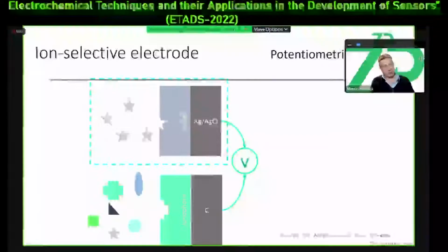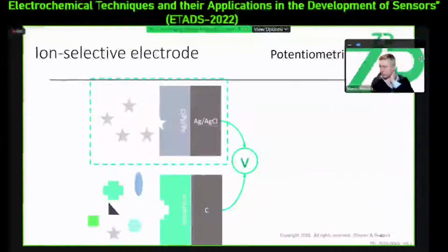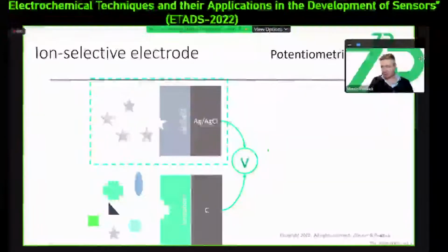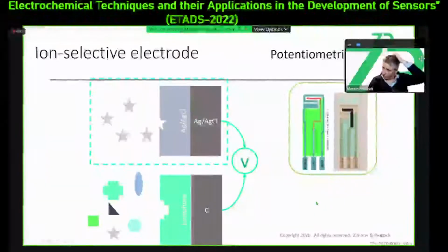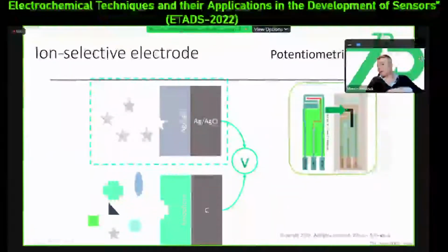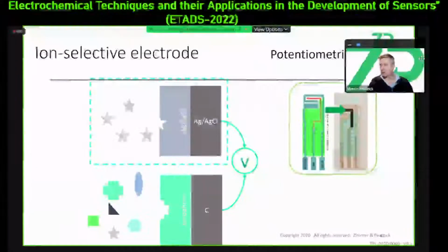If any of you are electronic engineers, ion selective electrodes and potentiometric experiments are one of the simplest circuits that you can design. So the one thing that's nice about potentiometric measurements is that if you're trying to make low-cost electronics, it's fairly straightforward. So in practical terms, there's a silver chloride reference and there's an ionophore or a working electrode. And so we often functionalize the black line. You'll notice this is the same electrode that we've been using throughout. I talked about the ZP hypervalue carbon electrode.